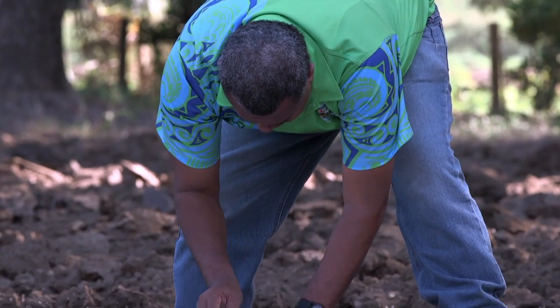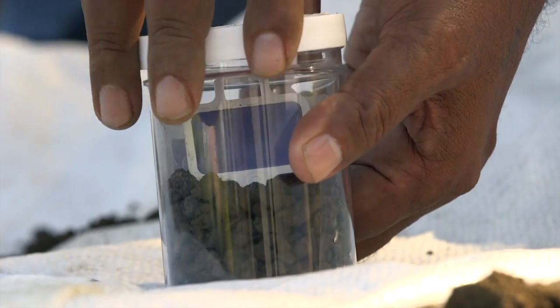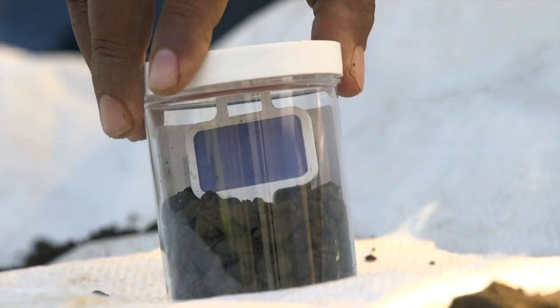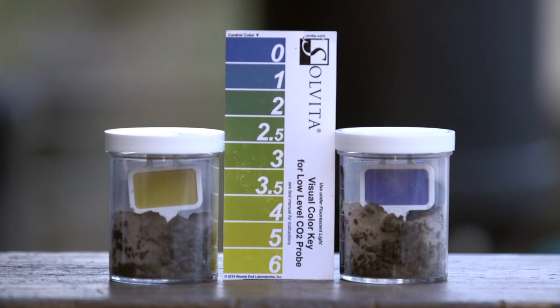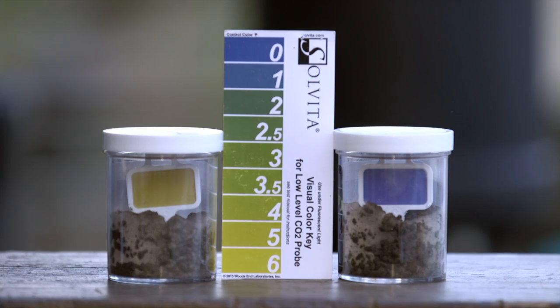Respiration. Take a soil sample and place it in the jar with an indicator leaf and close the lid. Leave it overnight for 24 hours, and when the time has elapsed, remove the indicator leaf and observe any color changes. Match it with the color chart, and the results will indicate the amount of CO2 released from the soil, indicating biological activity.